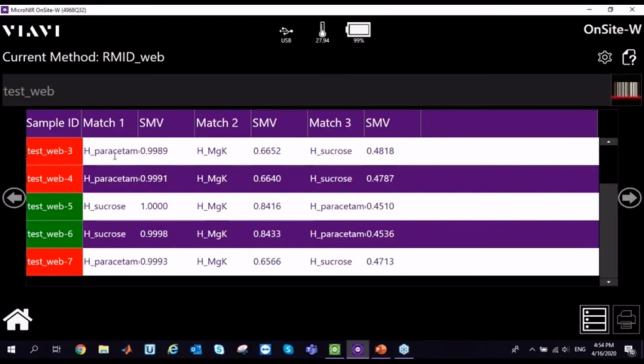What does it mean? And this is something that I cannot do in a more proper way, that I have just one type of paracetamol, and so my library was not robust enough to accept the variation in humidity. Of course, the better your library, so the more paracetamol you acquire, the stronger your model is. But you know that I'm at home and why I'm at home.